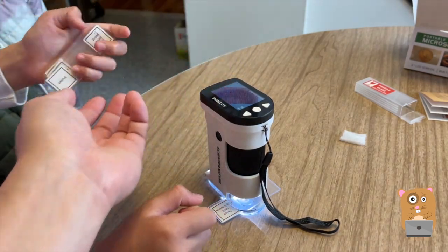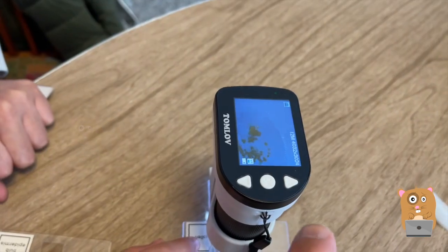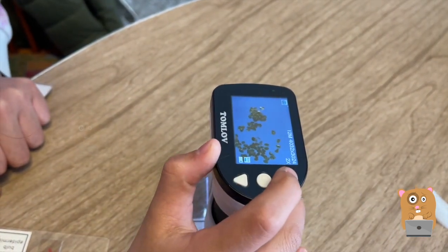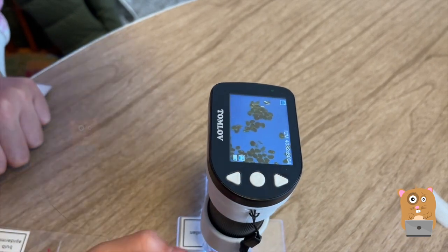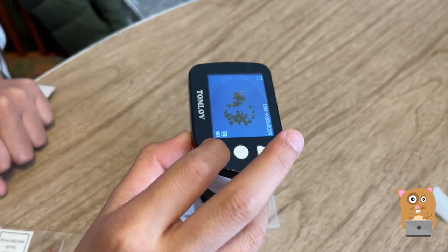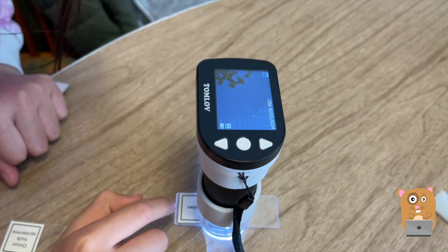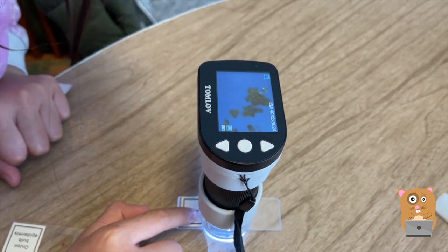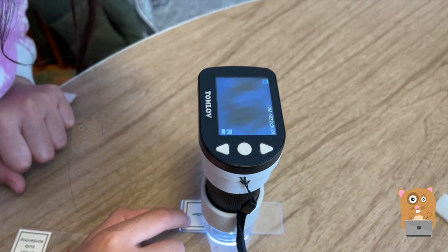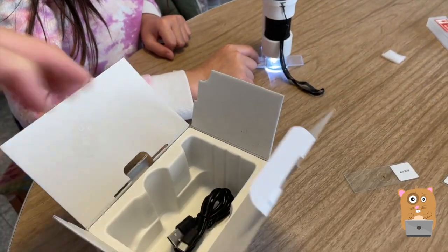Let me see what other slides you got. Pollen! You see these triangles? Press it. So then you can focus — you can use the focus ring to try to focus it even more. So that's what we breathe in every spring. I like this, it's so impressive.